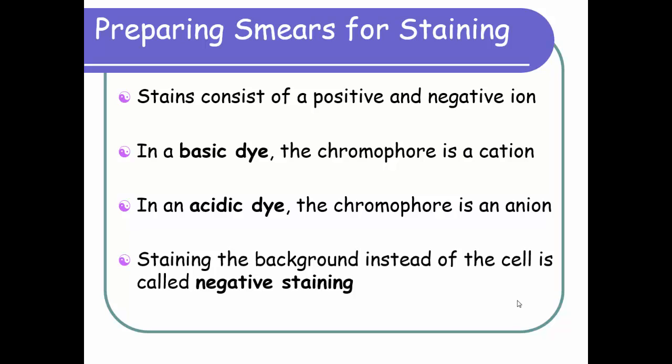Staining the background, the actual glass slide, instead of the cell is called negative staining, and our specimens stand out as ghosts, basically, against the dark background.